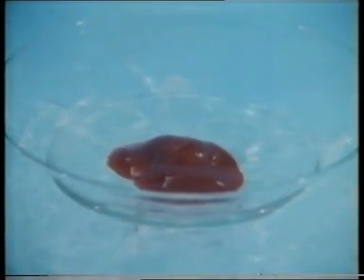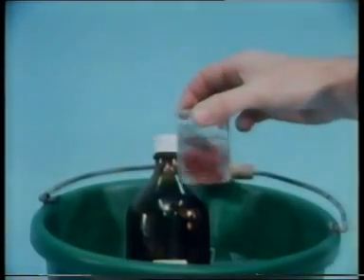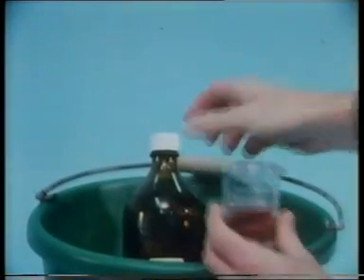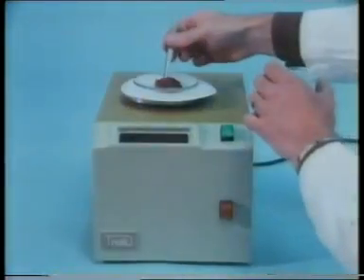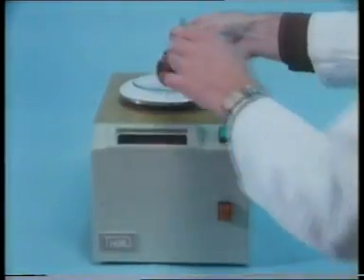This is the liver from a freshly killed laboratory rat, kept cool on ice. We're going to isolate the mitochondria from the liver cells. First, we rinse the liver with cold 0.25 molar sucrose solution, then it's weighed.